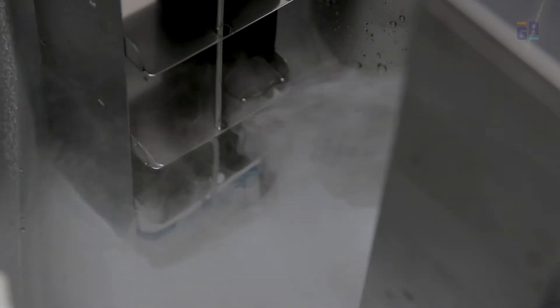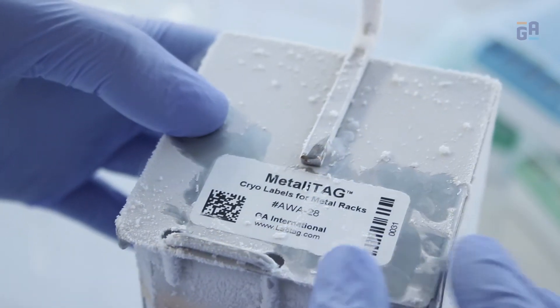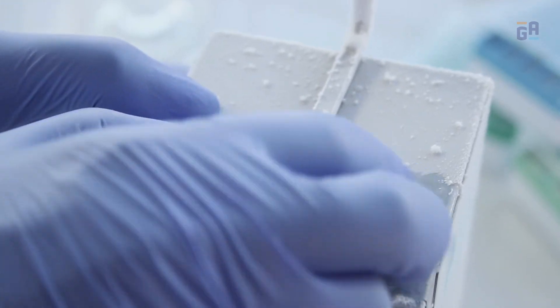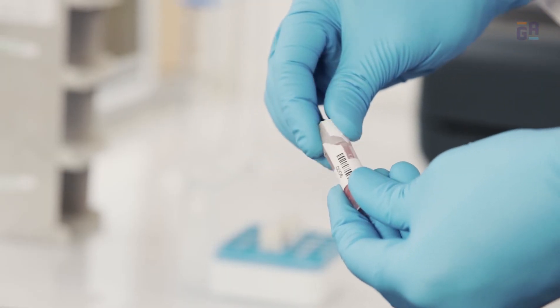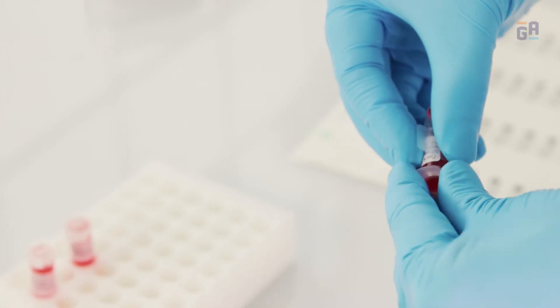We also have cryogenic labels that can adhere to metal and frozen surfaces, as well as labels that are tamper-evident, in addition to self-laminating labels.